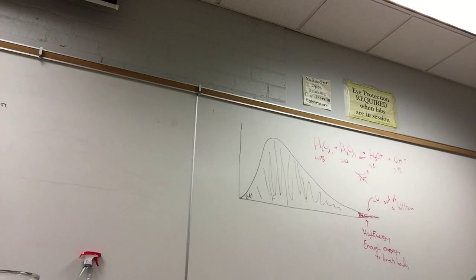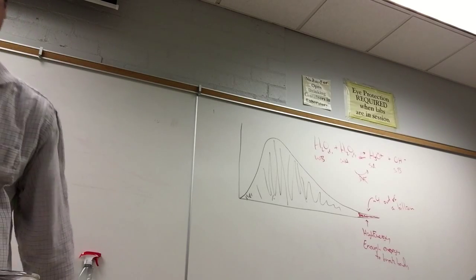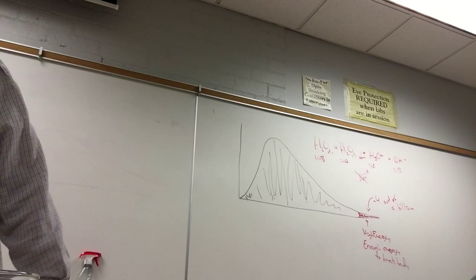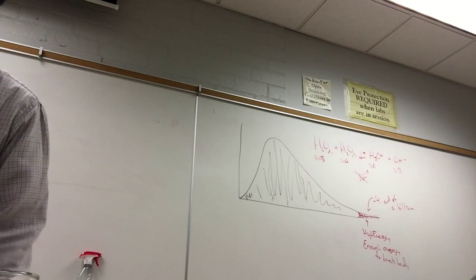Oh, actually, before potassium chlorate, we need to do one other thing. What is it? Solid sodium chloride. Let's try that.